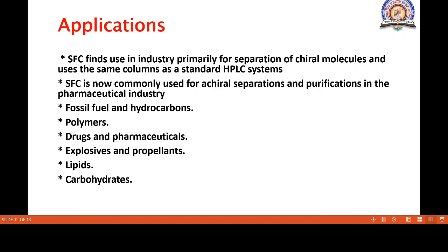So students, you have to remember this technique. Mainly, you have to remember the definition of SFC, then the principle of SFC and the application of SFC. At the FY level, you must know these three things: definition, principle, and application. And you must know the history, who invented this technique and in which year it was invented. That you must know at the FY level.